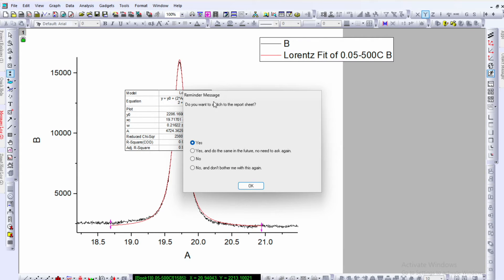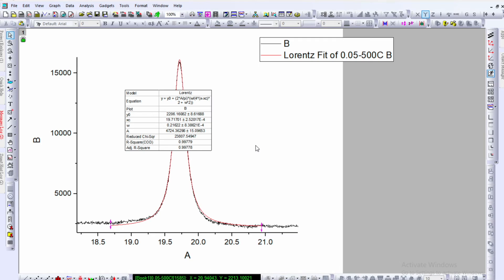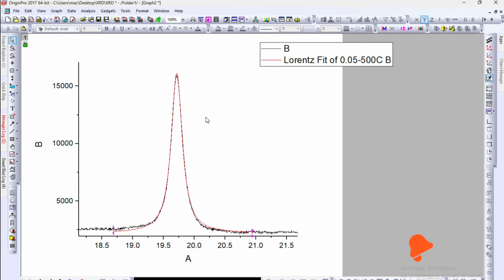A reminder message will ask if you want to switch to the report sheet — click OK. In the fitting details: y0 is the offset, xc is the peak center, w is the full width at half maxima, A is the area, and H is the height. Go back to your data. To fit the second peak, right-click and delete the previous selection.